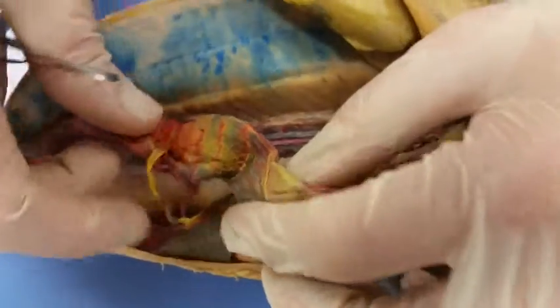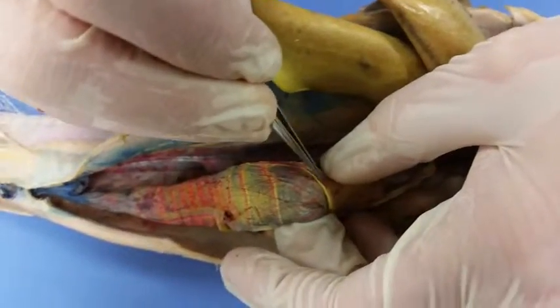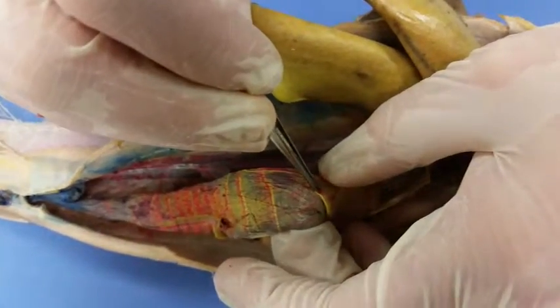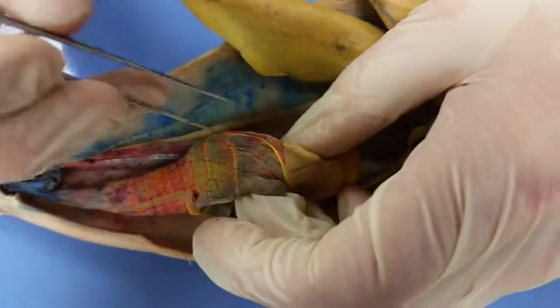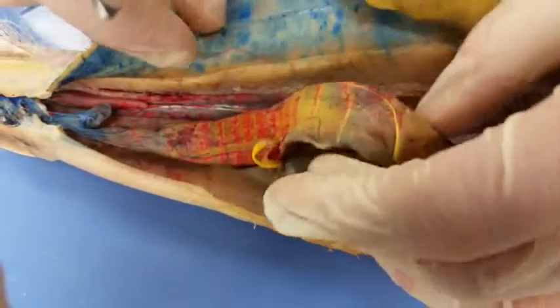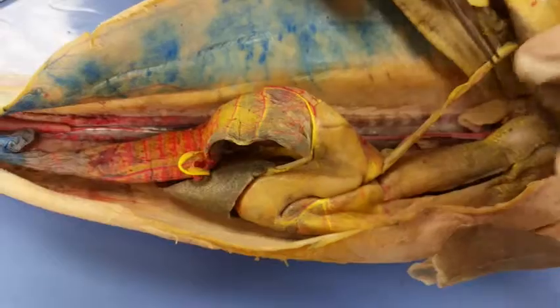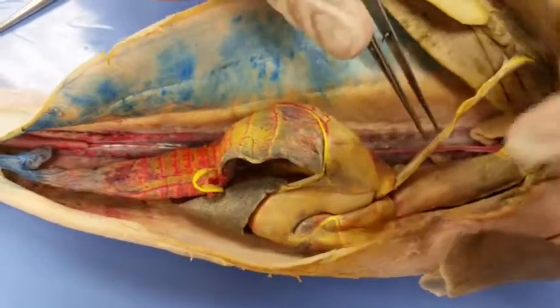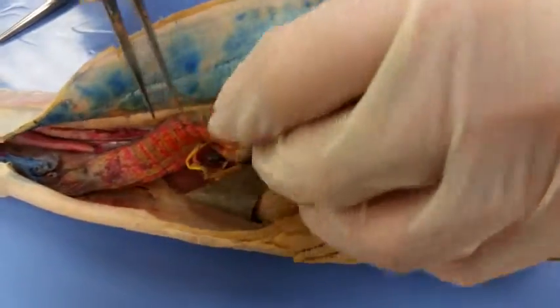Moving over to the valvular intestine. There's also an artery, which you can see right there. That's the anterior intestinal artery right on the valvular intestine. The pancreatico-mesenteric artery is still running down, so we had it run down pancreatico-mesenteric, running all the way down the valvular intestine.